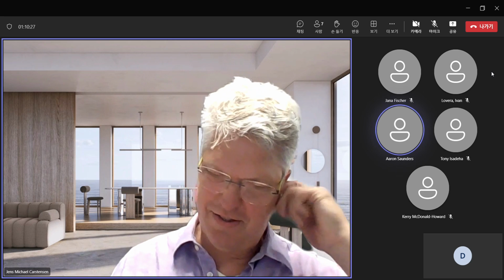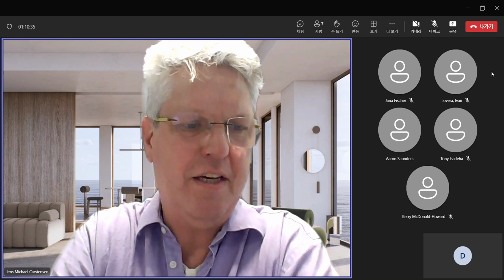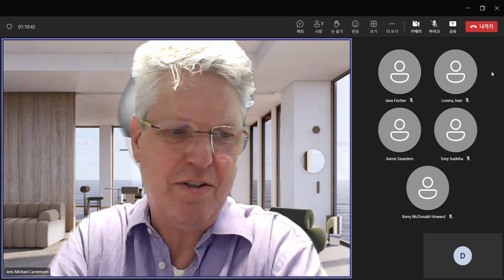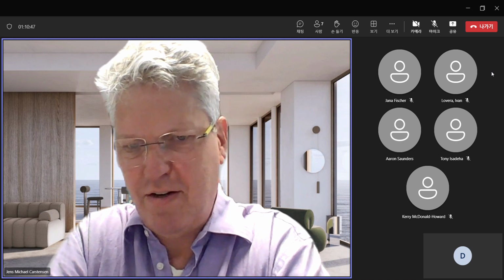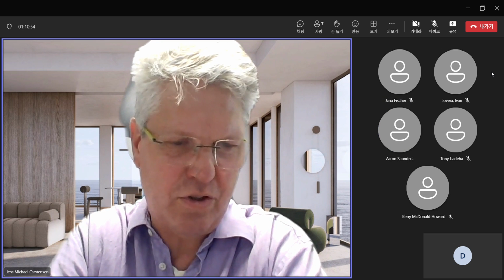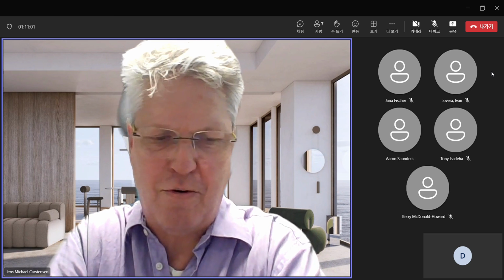They are naturally developing on the surface during the germination process of the barley. You can also do the same with other contaminants on the surface of the product. It could be molds, it could be other things. As one example here, we had scorched particles in milk powder. It's also good because it's not like you see either a scorched particle or a milk powder particle.